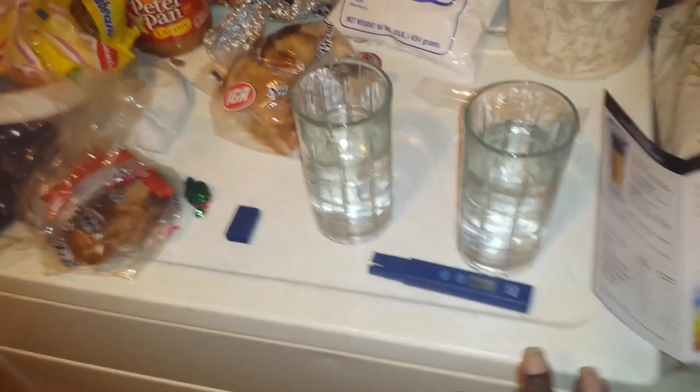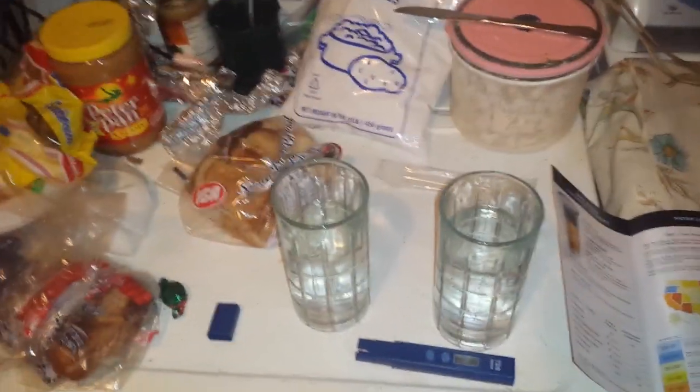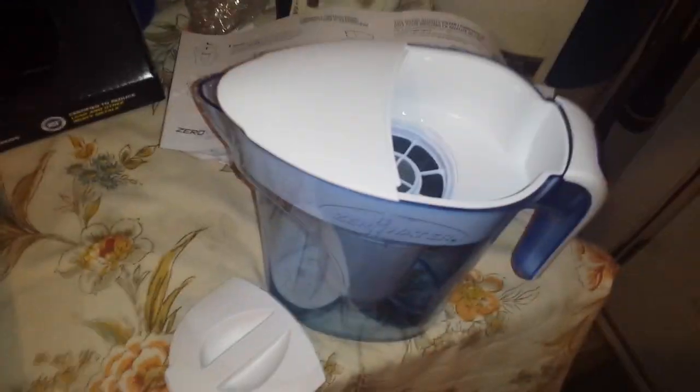That's what I'll do in part two — I'm actually going to compare this ZeroWater filter to the water bottles I get from the store. But just for now, comparing it to tap water and shower water: my shower water was at 110, the sink was at 120, and the ZeroWater is true to advertisement. It takes a minute to go through the filter, but it literally puts your water at zero.